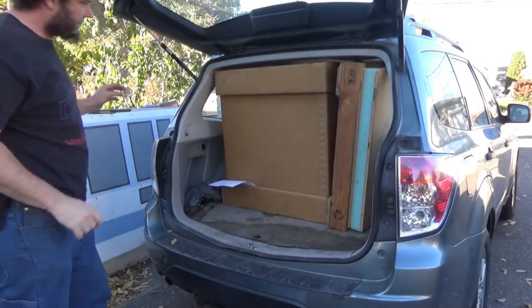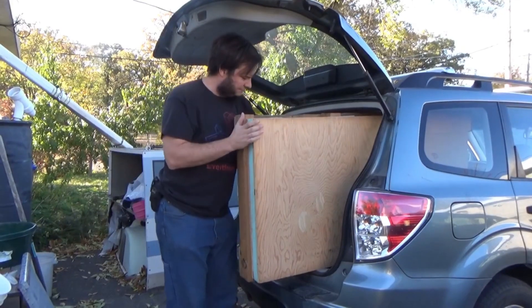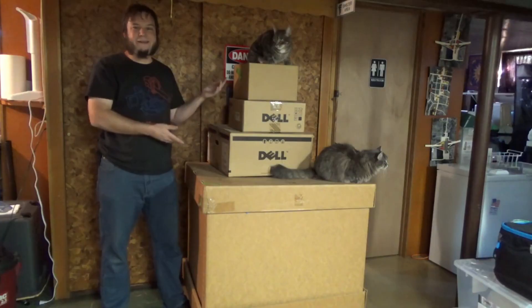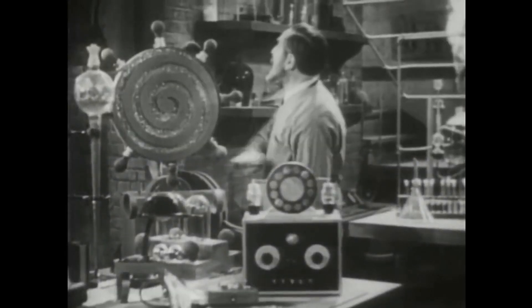However, it does weigh about 200 pounds with all the computer stuff and everything in there, and it only fits on a pallet. So you're not going to be able to ship it by US mail or UPS. It's going to have to go freight, which is not cheap. It would be a lot easier if there's somebody nearby that would be able to pick it up in Minneapolis. That would be cheaper and easier for everybody.